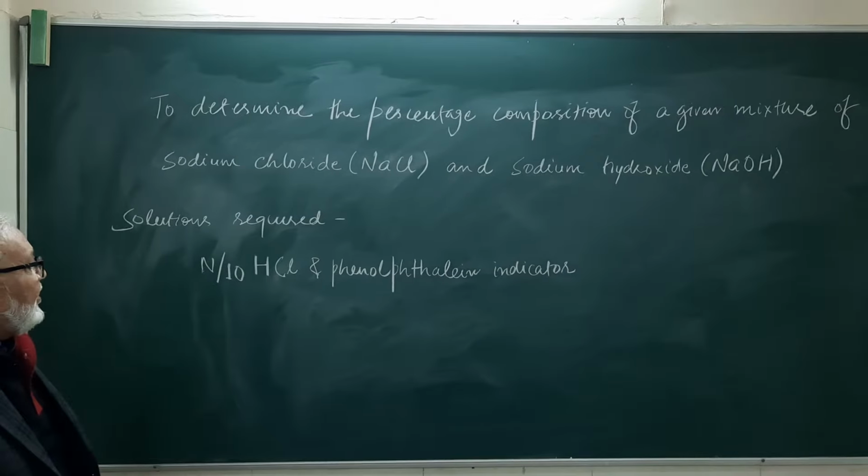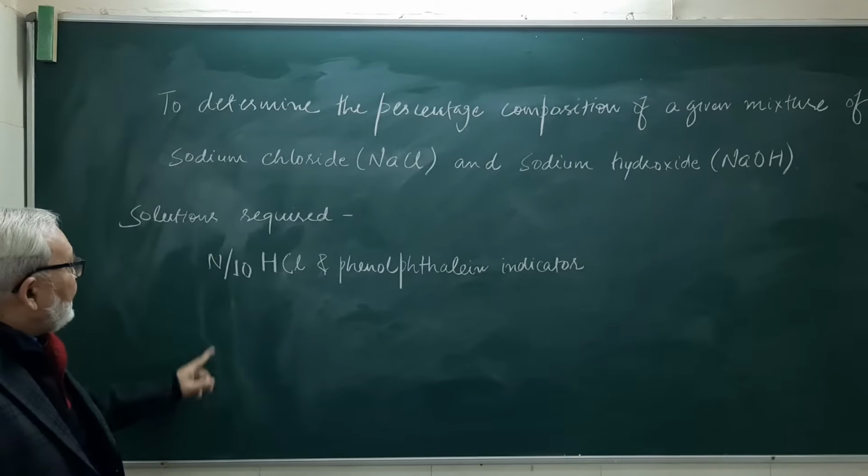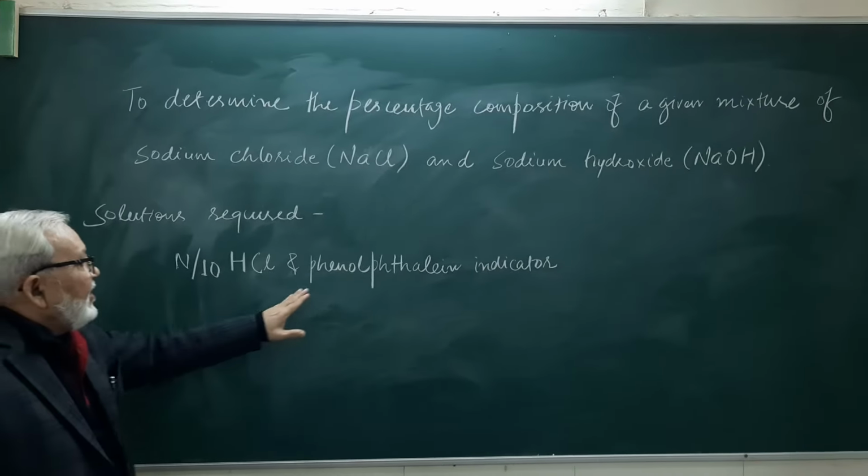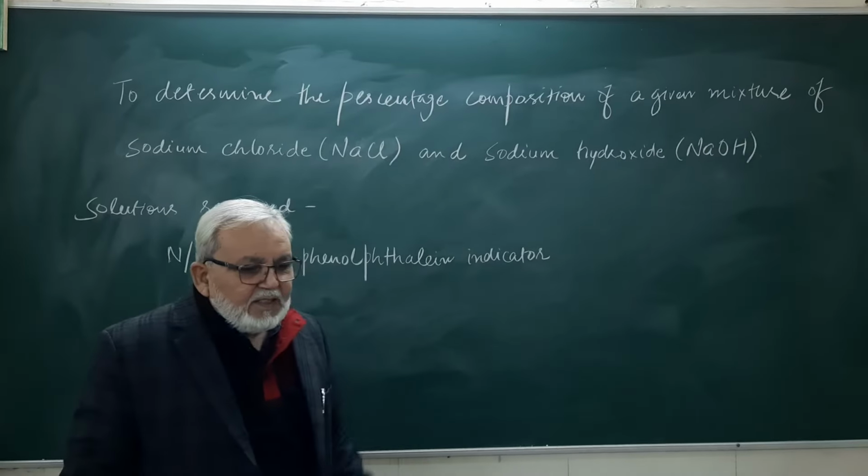Solutions required for this experiment: N/10 HCl, phenolphthalein indicator.